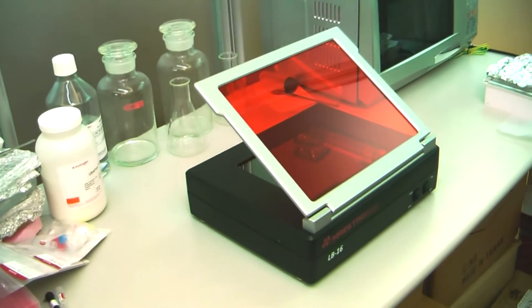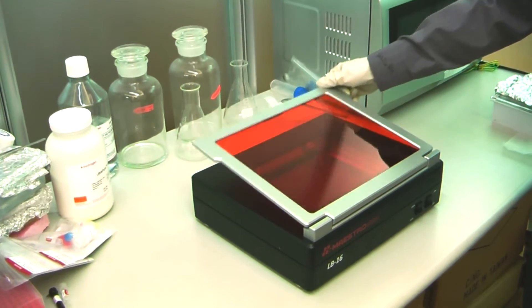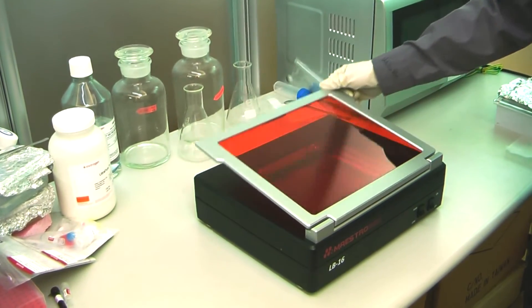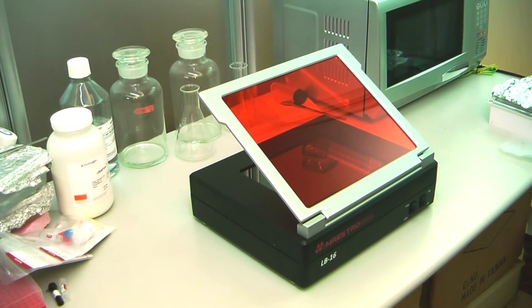Unlike other LED trans illuminators, the Mestrogen Ultra Bright LED Trans Illuminator has a strong metal frame to support the amber filter. Users, therefore, are not required to wear amber glasses during the gel cutting process.